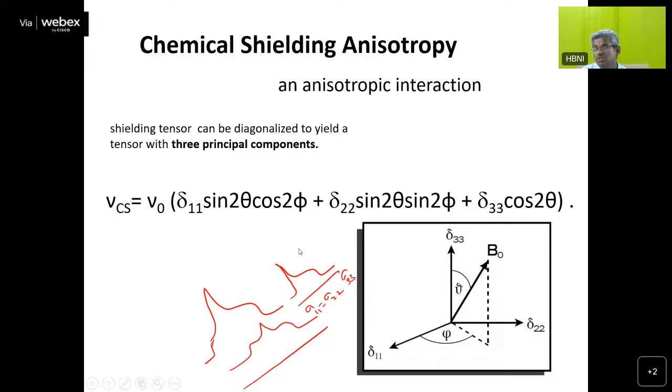In the last class, I mentioned simulated NMR spectra. Once you get the experimental pattern, we try to see whether we can simulate that NMR pattern. How to simulate it? It is simple. There are programs, but forget about programs. The basic principle is that the chemical shift can change the resonant frequency.